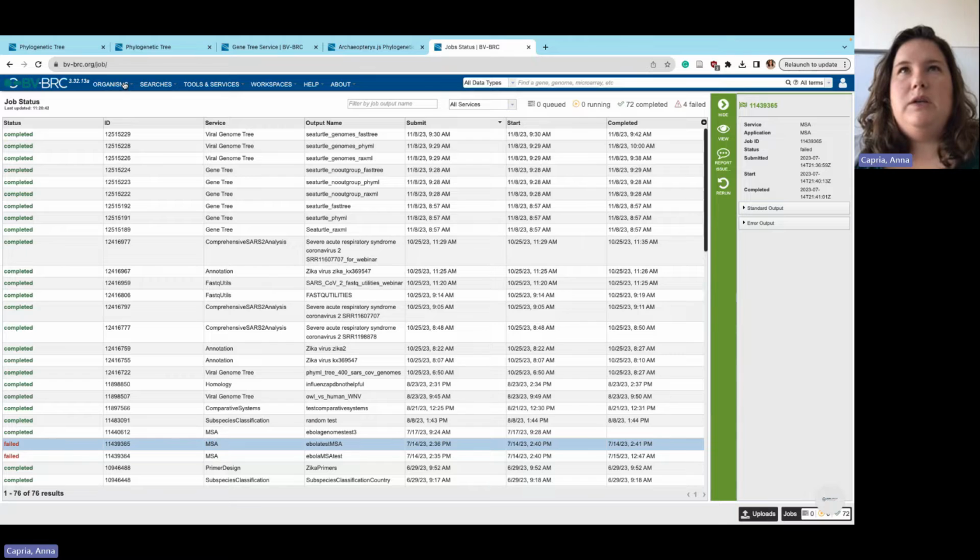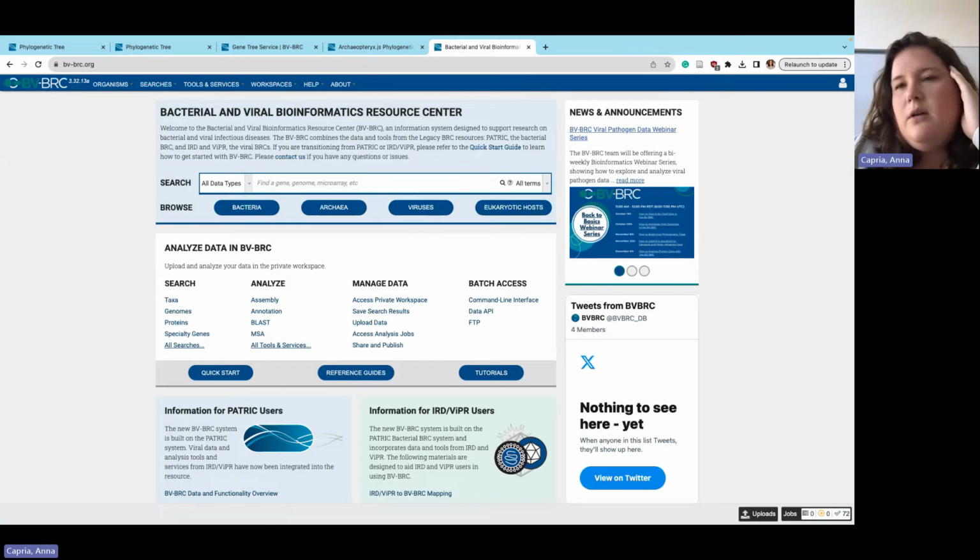Let's orient ourselves with the data a bit more. I'm going to be showing you a few different phylogenetic trees. Recently, I traveled to the Florida Keys and I learned about a herpes virus that is leading to tumors on sea turtles. So I made some phylogenetic trees with that data, but just to see if we even had the genomic data for that herpes virus, I did a broad search, so I'm going to walk you through what that looks like.